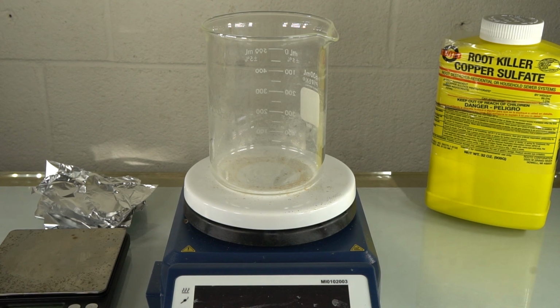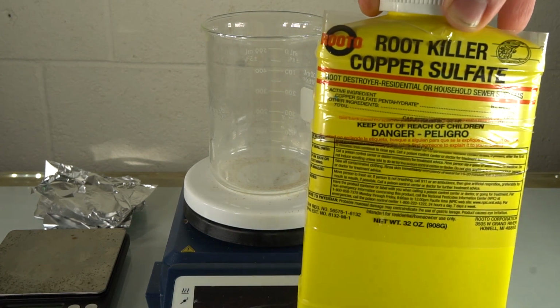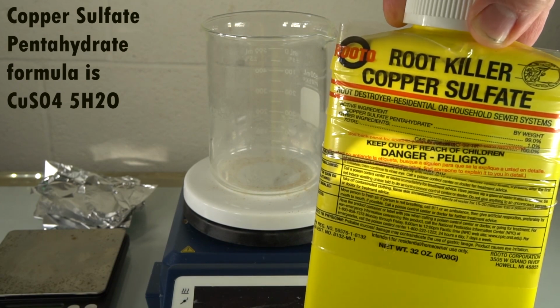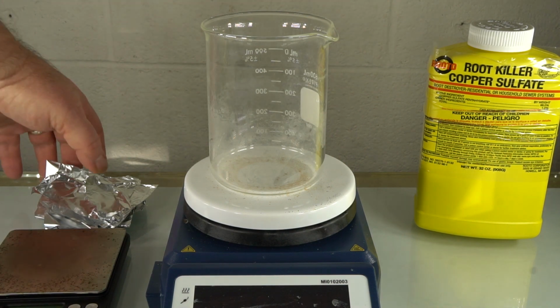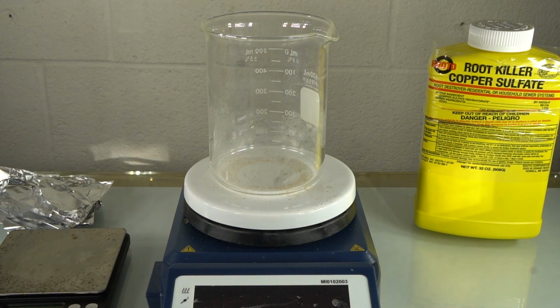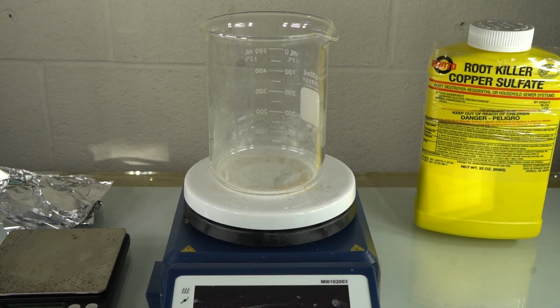What are we going to use in this reaction? We have some copper sulfate. Copper sulfate you can buy as root killer, at least in the United States. It's sold in a lot of different hardware stores. I think I got mine at Ace Hardware. You also need aluminum foil, and we have some aluminum foil here. You need water, and you need good old salt. And that's pretty much it.